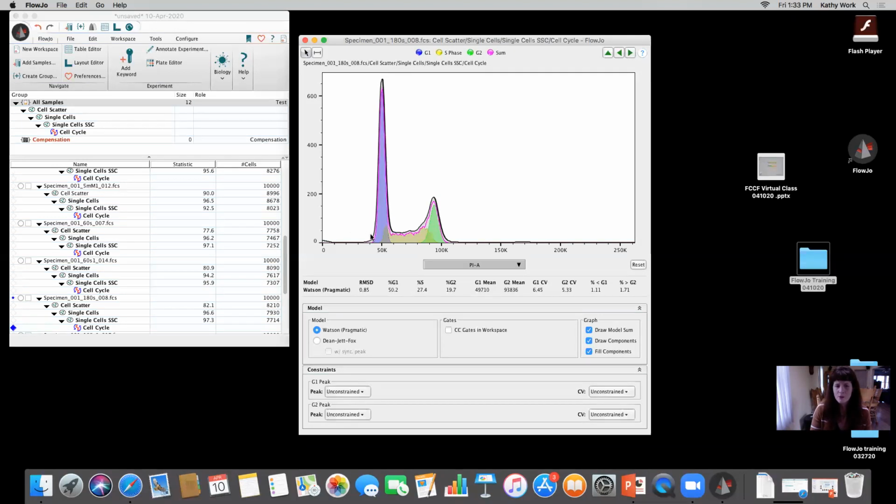And when I say sub G1, right, this G1 peak right here in a nice controlled sample, everything below that would be considered sub G1. Sometimes you see a hump here, and that is typically referred to as sub G1, or cells that are maybe starting to have DNA fragmentation, starting to undergo apoptosis. You might see them there, and that might throw it a little bit. So if there's time at the end, I could always bring that in after we do our second analysis.